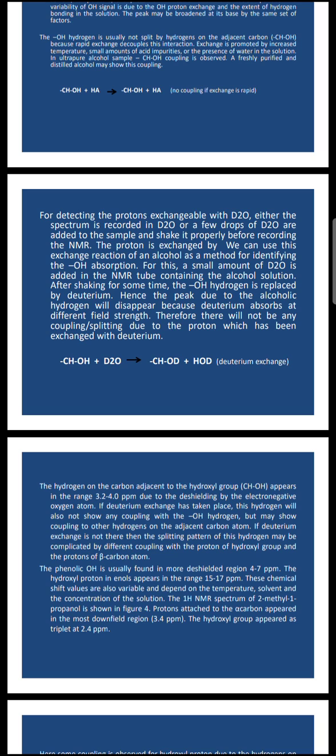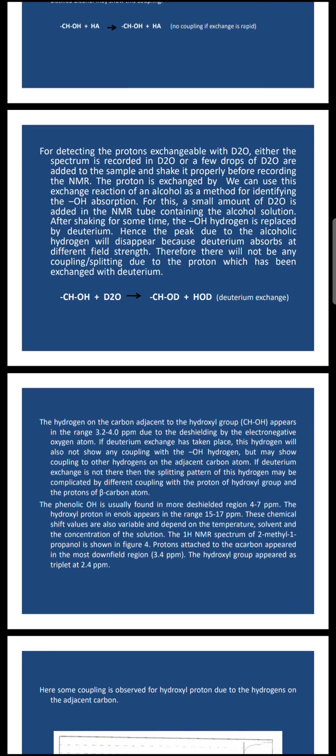After shaking for some time, the OH hydrogen is replaced by deuterium, hence the peak due to the alcoholic hydrogen will disappear because deuterium absorbs at a different field. Therefore, there will not be any coupling or splitting due to the proton which has been exchanged with deuterium. CH-OH plus D2O goes to CH-OD plus HOD, deuterium exchange.